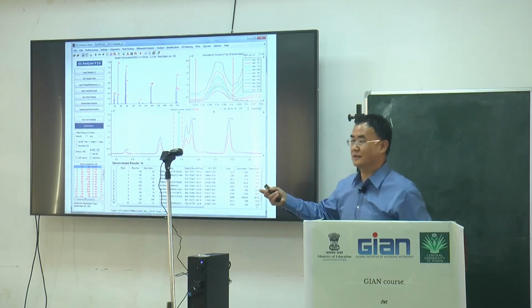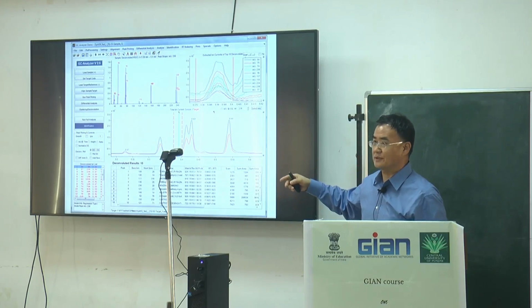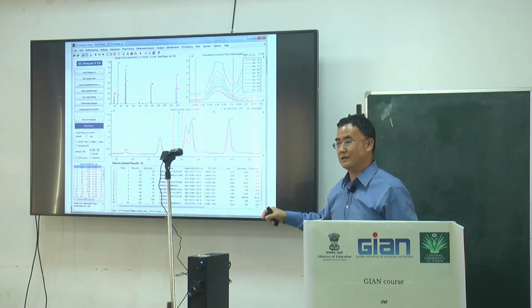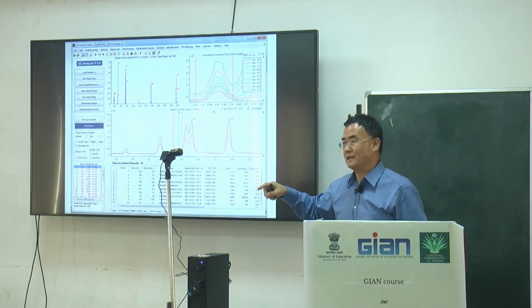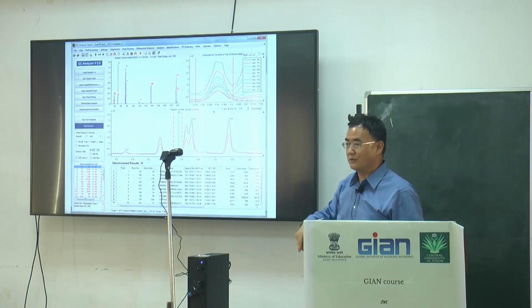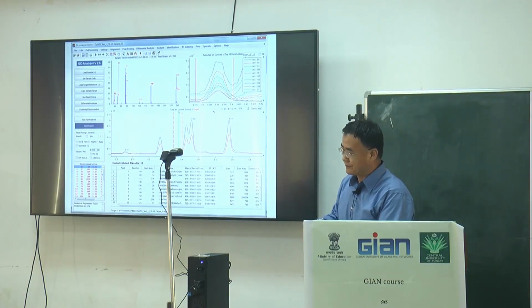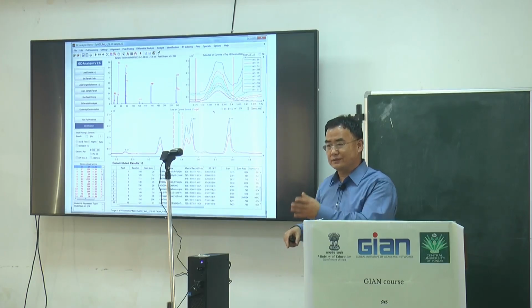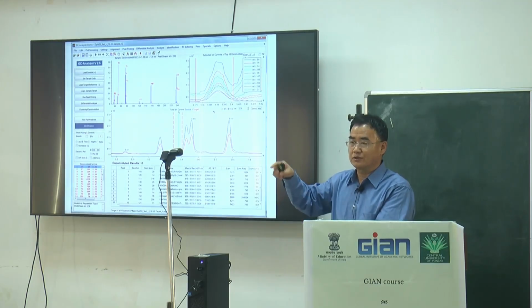Just like UPLC or HPLC, after that we have to spend several minutes using very high charge. If we use reverse phase HPLC, it means that we don't use charged or highly charged material for the column.